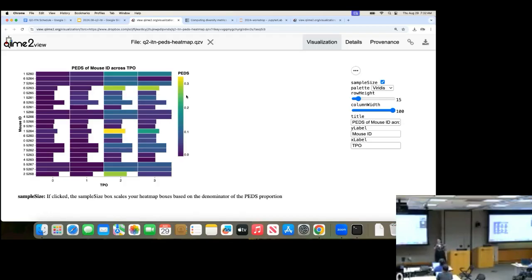And according to Aguala et al., I think we're over the 17%. And so it may be perfectly high engraftment. It's a little hard to tell with just any one piece of data.